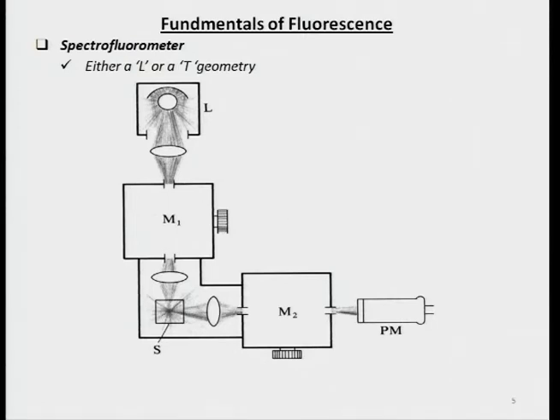And then the UV visible spectrophotometer would measure light that is actually coming out from here. So it measures the intensity difference between light incident and light coming out, and that is the UV visible spectrophotometer. Whereas for fluorescence, light that comes out of the sample is measured on the right hand side, either here or on the left hand side, or both, so that you can follow multiple wavelengths. And what is coming out can also be recorded on a spectrophotometer, followed by detection using a photomultiplier tube. So this in essence is the rudimentary element of a spectrofluorometer.